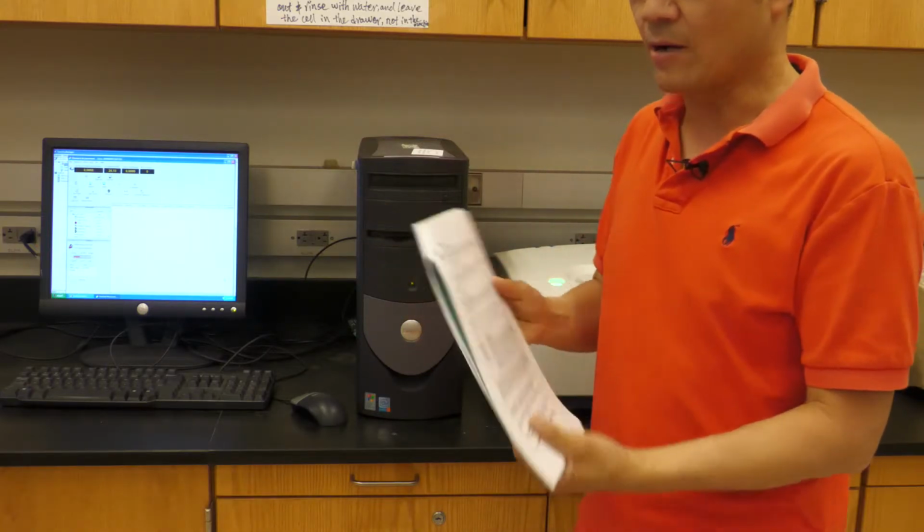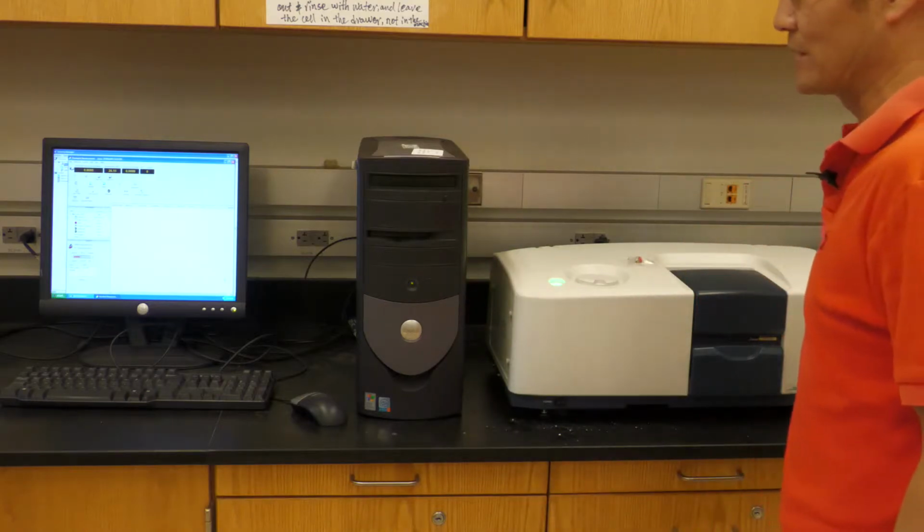Now in this handout, the general idea is we will study the hydrolysis of sucrose. Sucrose will react with water to form glucose and fructose. Reacting with water is called hydrolysis. Now, it's very, very slow.